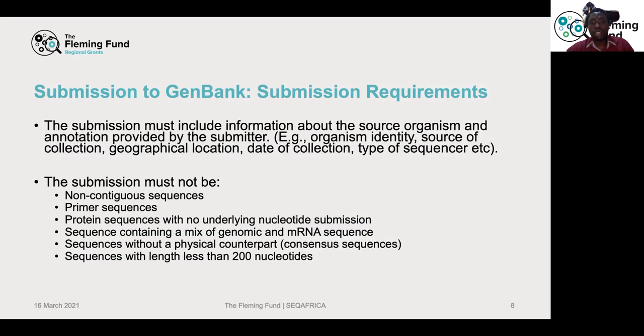So you have to give a lot of details on the geographical location, on the date of collection too. What kind of sequencer was used? And I think those are the basic information you need to give. There are some submissions that won't be accepted.